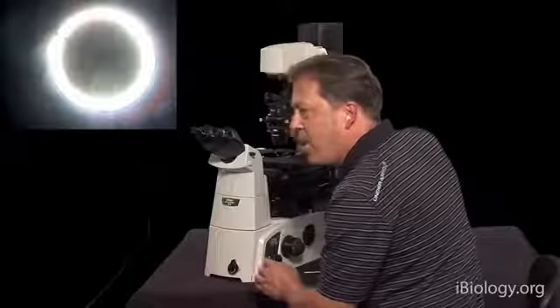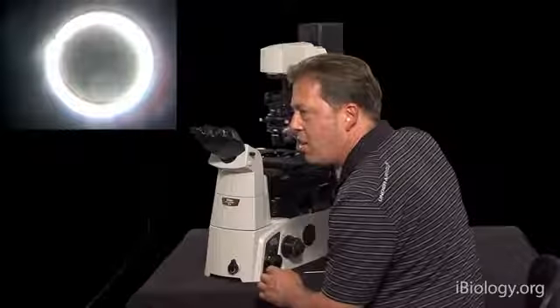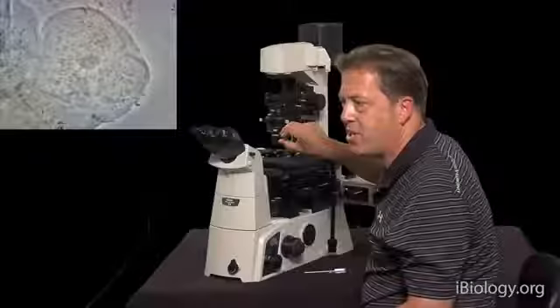And what you can see now is that if I move this phase annulus, you can see the ring in the objective lens behind it. Now that these are off alignment with one another, if I move back to the image, you really can't see any contrast in the image of the cell. Now as I move that annulus back, you start to see that contrast returning, and when you hit perfect alignment, you see really nice contrast in the cells.